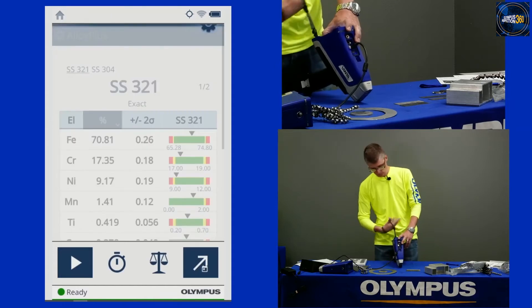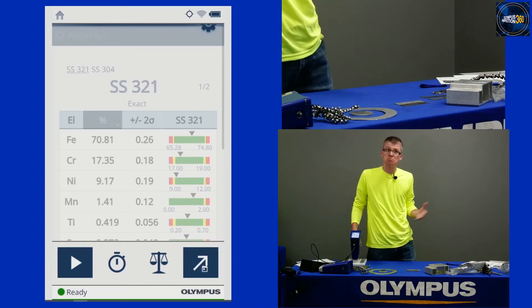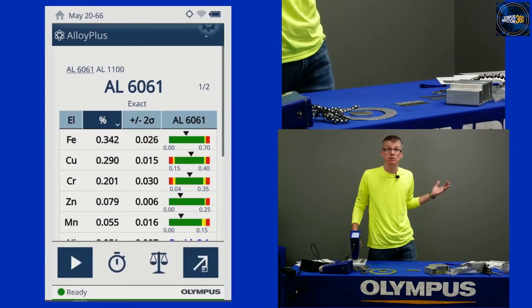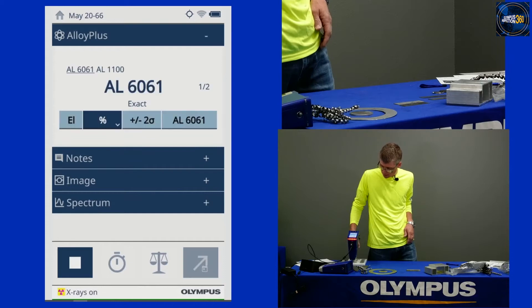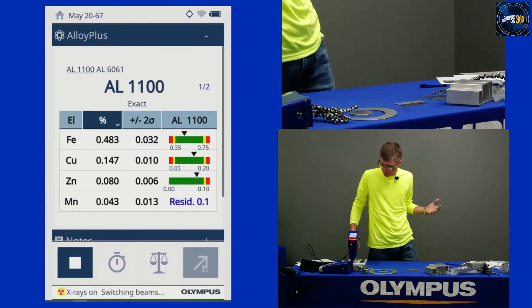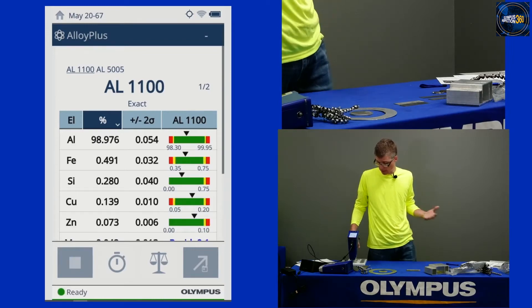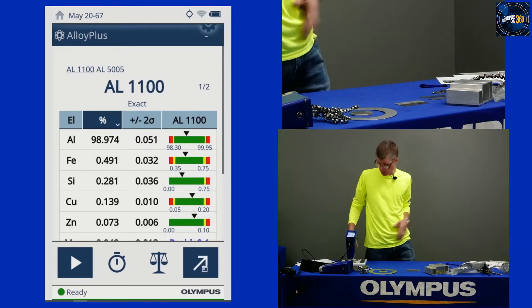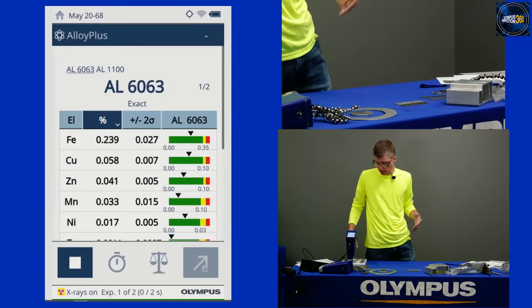Let me show you what that looks like. Here's a simple grade 6061 — it's an aluminum, a single beam grade. You can see the instrument starts, exact match, stops after the first beam. Take something like aluminum 1100 — not many micro-alloying elements there. You see an exact match in the first beam right away, but it's going to roll over into the second beam to confirm. I didn't have to make any decision — it did it on my behalf. Exact match. Three to four seconds and you're sorting. Correctly sorted 1100 from 6063 — that's a common mixup on other instruments, but sorted quickly here on the Vanta.